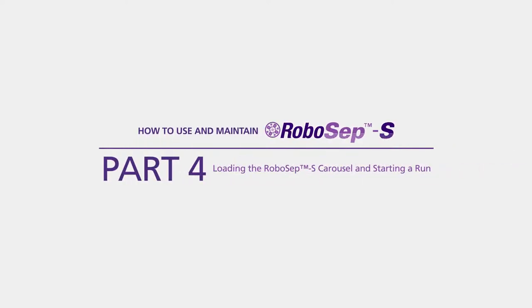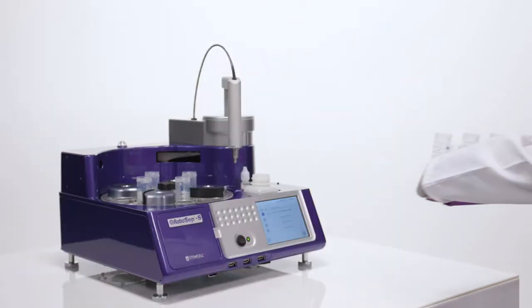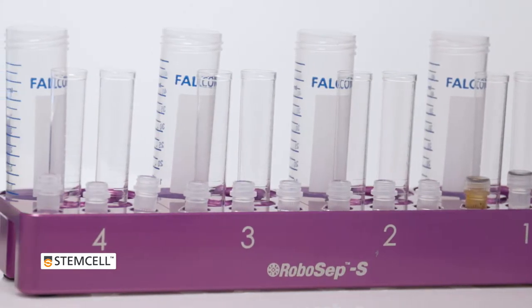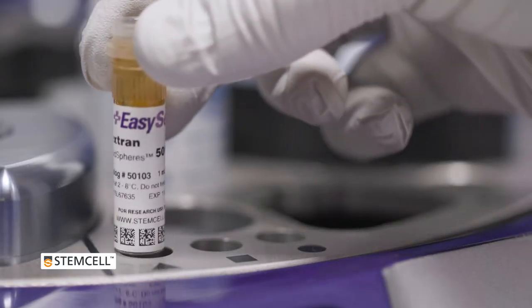Part 4: Loading the RoboCEP Carousel and Starting a Run. RoboCEP S comes with a RoboCEP service rack to hold and organize reagents and sample tubes prior to loading them onto the carousel.